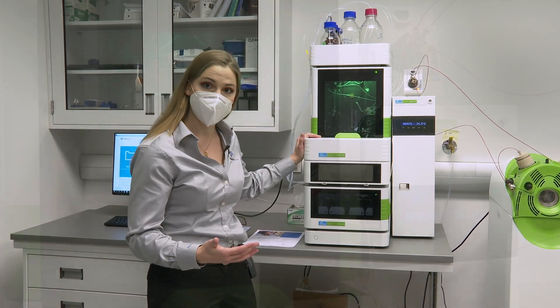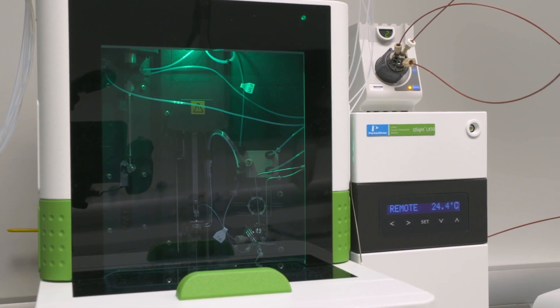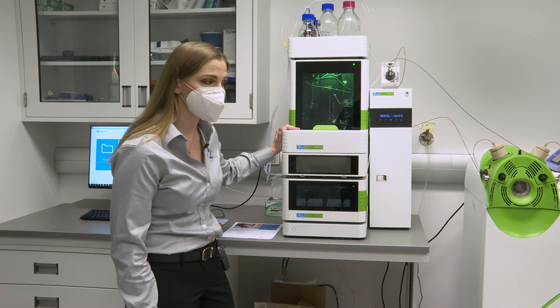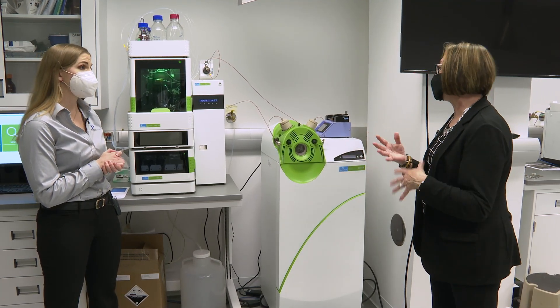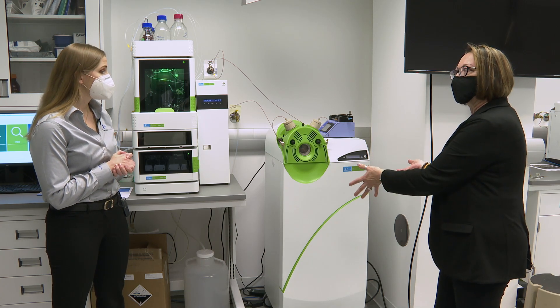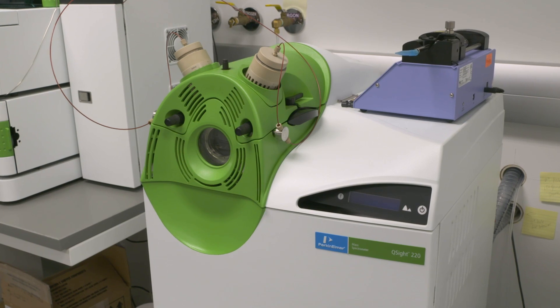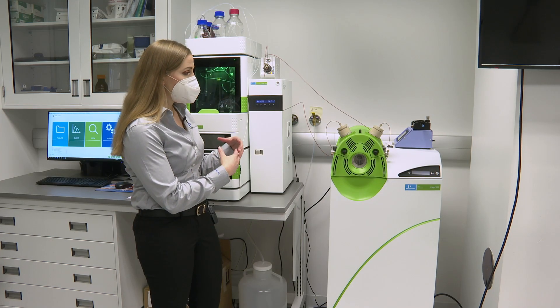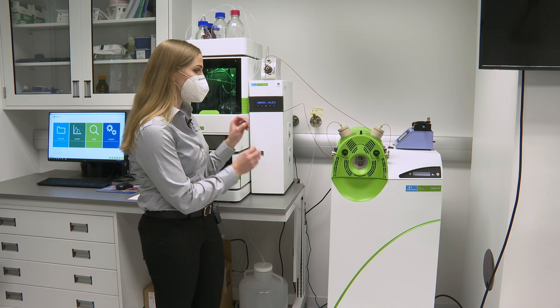We can detect PFAS in drinking water using EPA 537. We have methods for groundwater and wastewater as well. Basically anything that accumulates in the environment that you need to detect in your samples, we can do by LC-MS. The unique thing about the Q-Sight, as opposed to other LC-MS systems on the market, is that it tolerates dirty matrix types very, very well. We call it stay clean technology, because you have to do very little sample prep to get great data off this instrument.